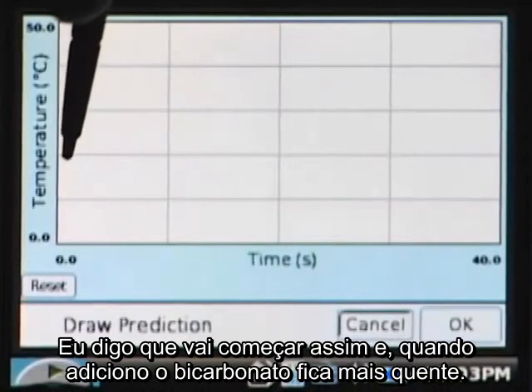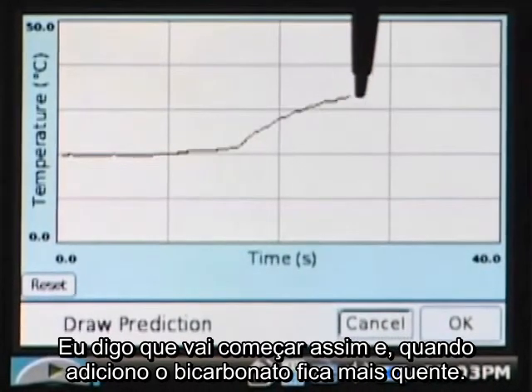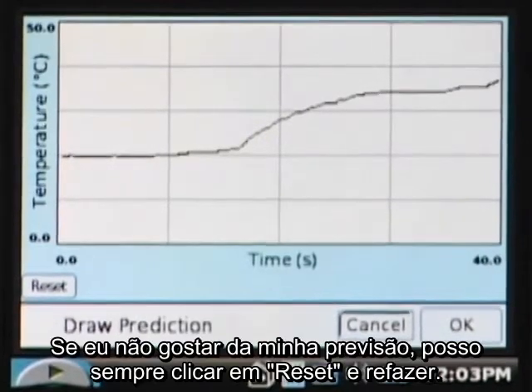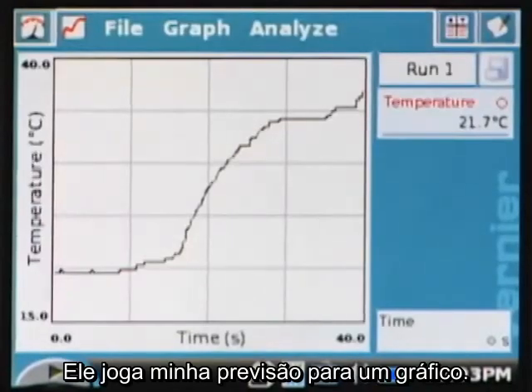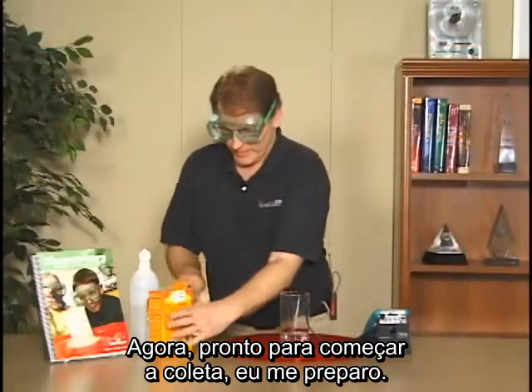So I'm going to say, well, maybe it goes along like this, and I add the baking soda, and then maybe it gets warmer. If I don't like my prediction, I can always press reset and do another one, but I'm fine with that one. So I'll say OK. And so it draws my prediction on the graph, and now I'm ready to begin the collection.